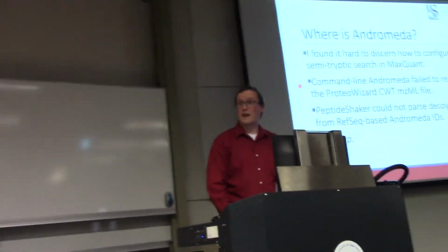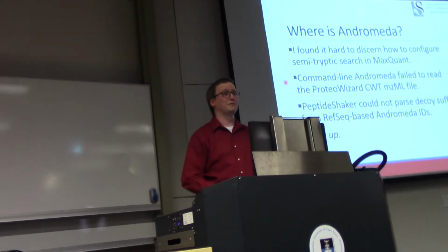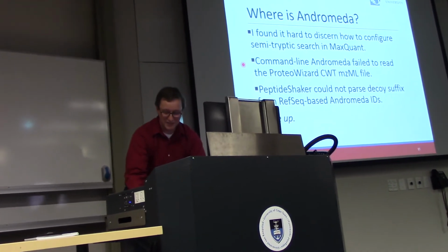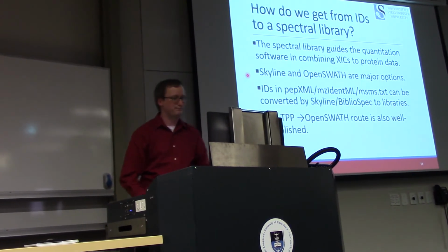So I threw it out. I threw it out again, and I'm sorry that I don't have a comparison to show you. I had to leave for vacation rather than spend another week on this. I'm sorry. So Andromeda is software that a lot of people use. It's obviously very significant. I was not able to get search results with it.